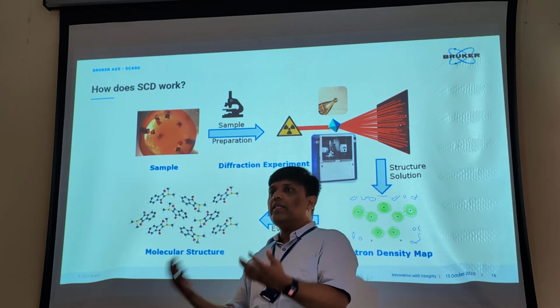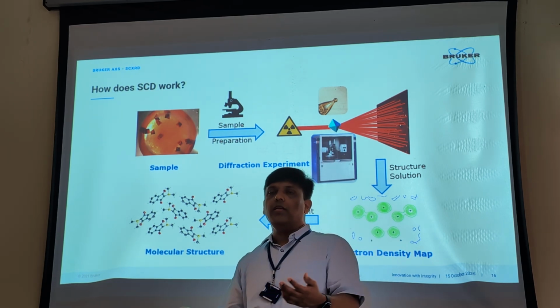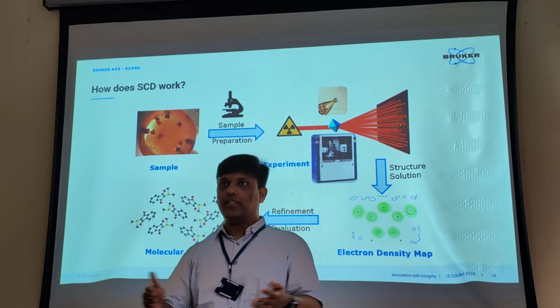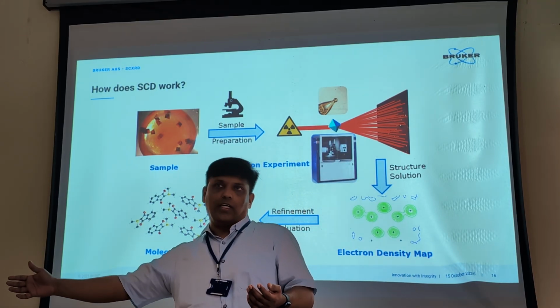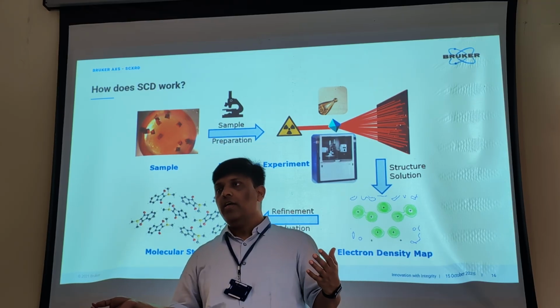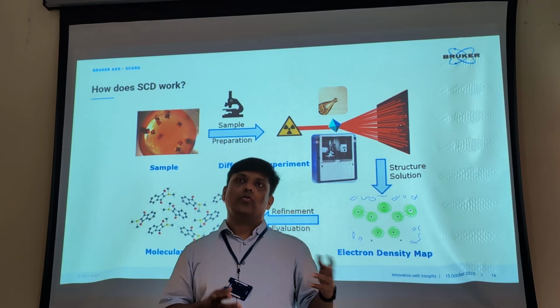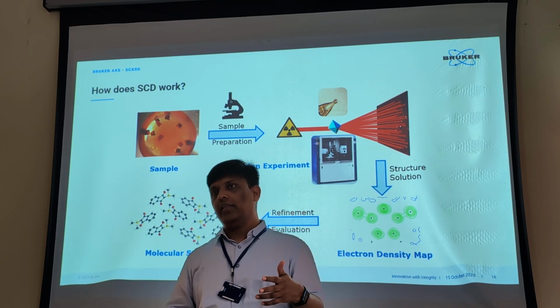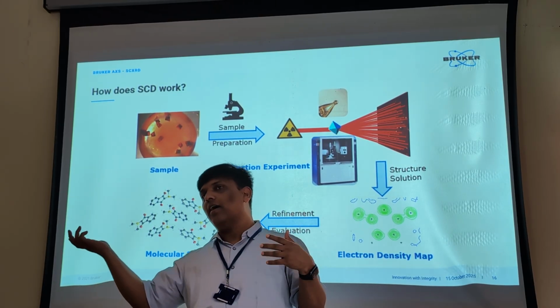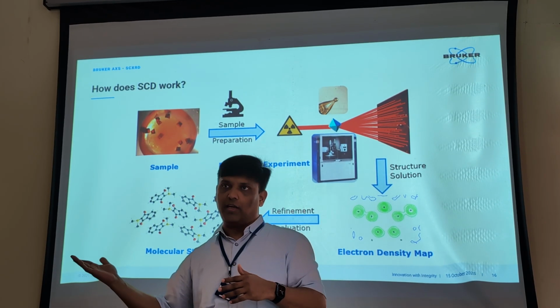It depends on the scattering power of your crystal. It might take 1 hour of data collection, 10 hours, or even 20 hours. Nowadays, with a much better source and much better detectors, data collection has become very short, whereas in earlier days you needed to take a lot of time.